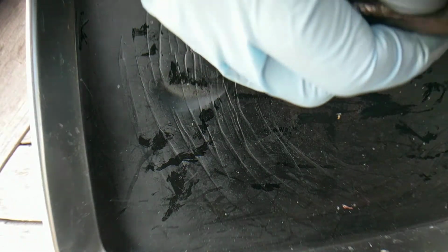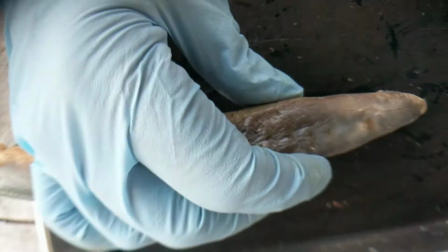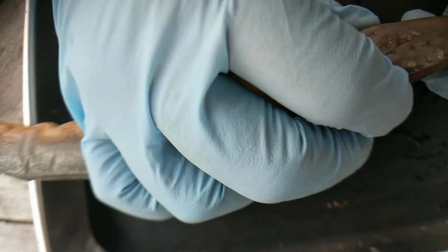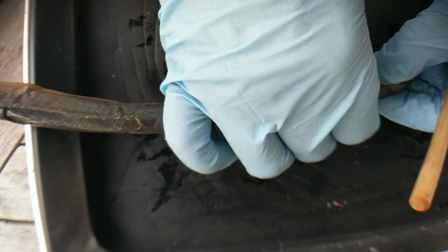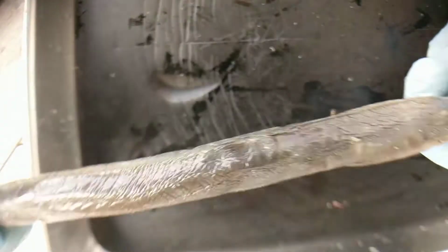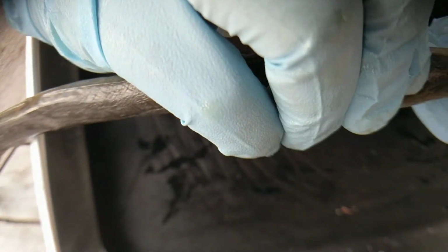Where's the eyes? So these eyes are very primitive eyes on the side here, light sensing organs. And then in the center, where is it? Let me flatten him out a little bit so you can see. There we go. Okay, so on the top of the head, this is really cool. So here's the eyes, either side, very reduced.